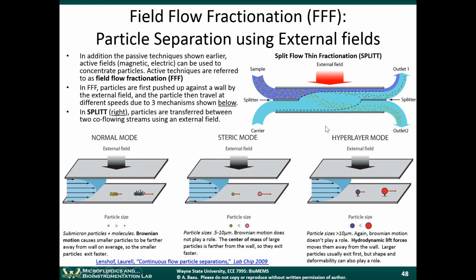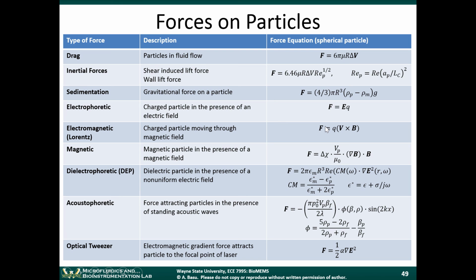So this is field flow fractionation. Now, from a theoretical standpoint, there are all sorts of forces that you can exert on particles. Electrical and magnetic forces are just two examples. There are drag forces, there are inertial forces, and we've talked about those. There are sedimentation forces. Particles will sink to the bottom due to gravity.